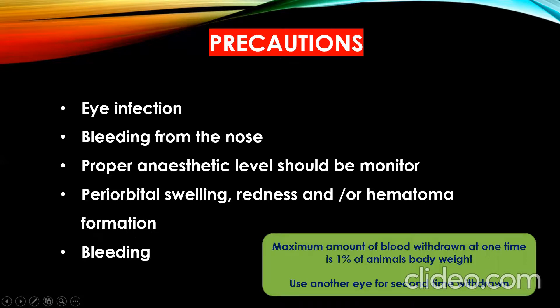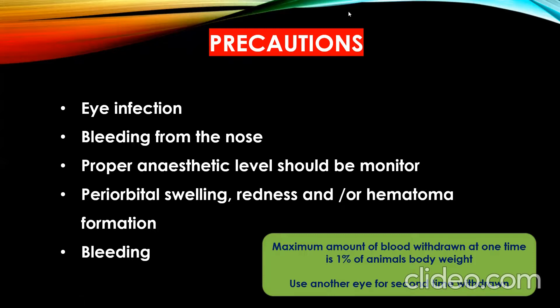There is a chance of bleeding, so while withdrawing the blood, maximum care is required to avoid injury as well as infection in the animal. The maximum amount of blood withdrawal at one time is one percent of the animal's body weight. If the first time one eye is used, then next time use the second eye to withdraw the blood.